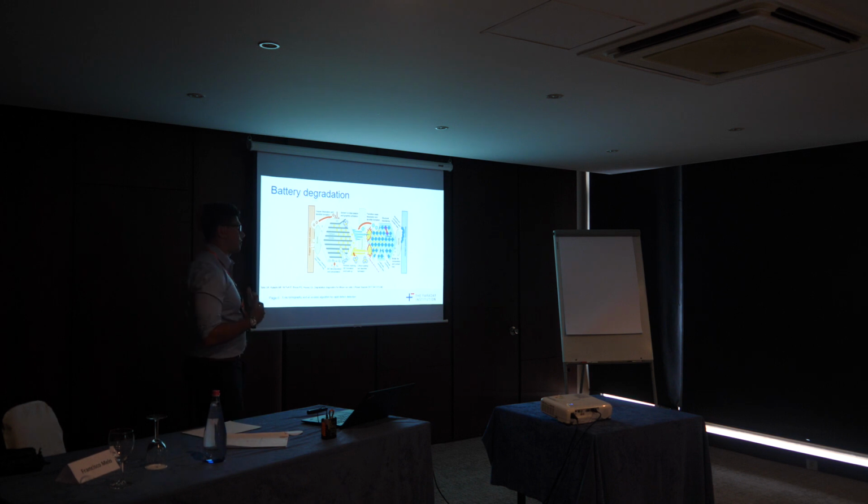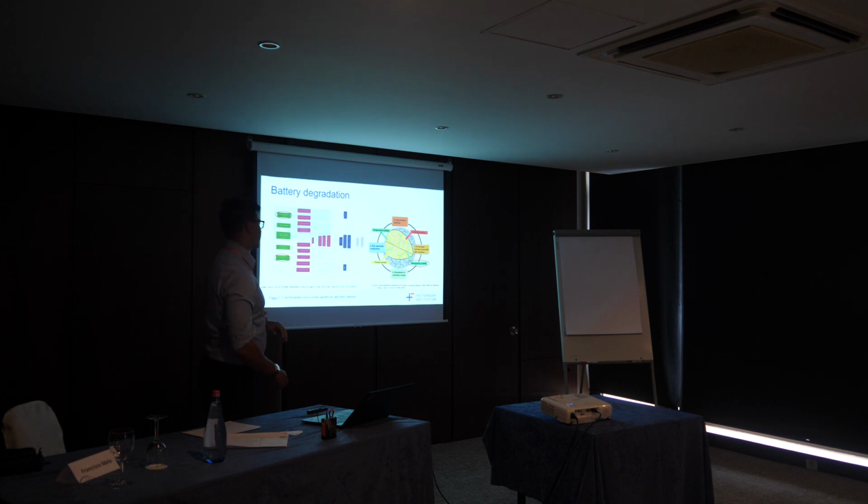And doing this doesn't just cause cracking in our particles, it causes a whole range of degradation mechanisms, some of which are coupled together, as you can see from this image on the left. So we have particle fracture down here, and this can lead to new surfaces being exposed. Because our cells are wet, when these surfaces are exposed, the electrolyte seeps in, which causes side reactions, which causes a loss of lithium, and eventually you get battery failure.